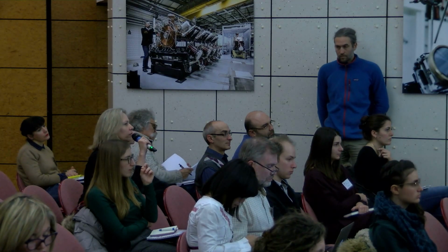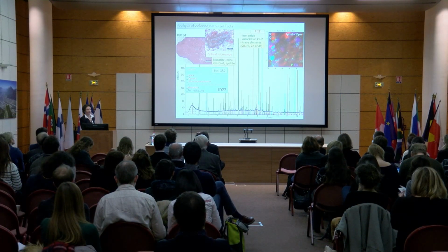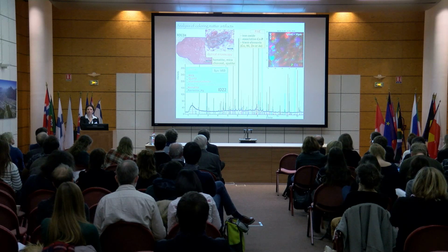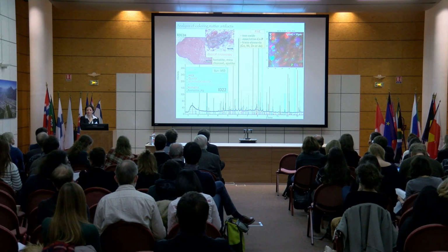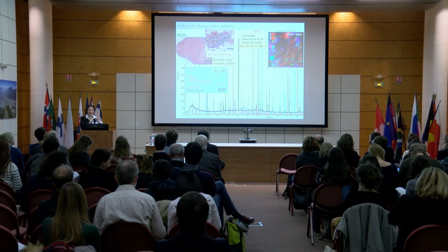No. If you see, there is really charcoal coming from the burning. Yes, it's not only due to the presence of carbon, but we really visualize the shape and the morphology of the charcoal.